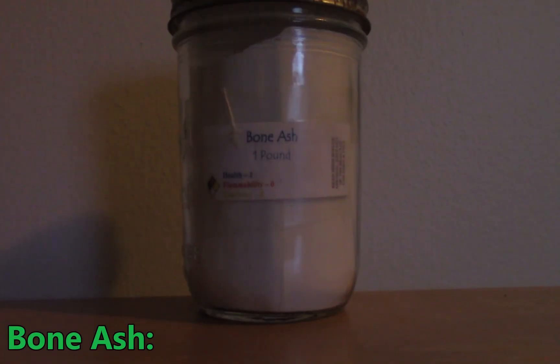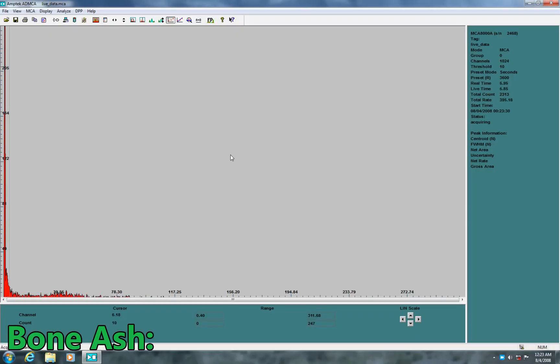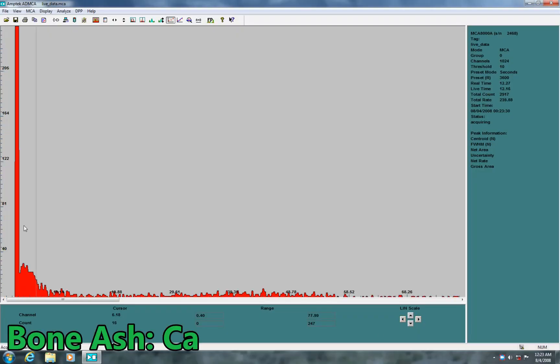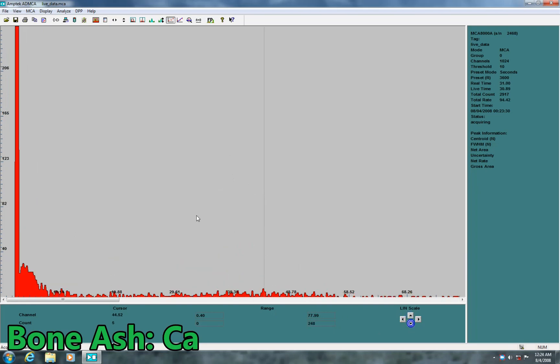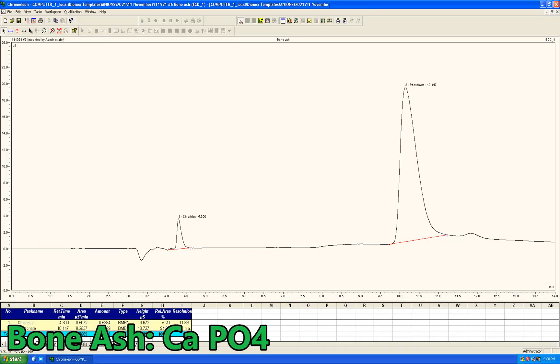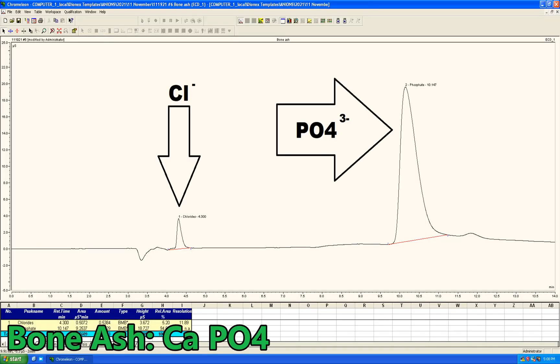Starting with the bone ash, the XRF immediately picked up the large calcium peak on the left, and maybe some heavier metals — it's hard to say with my poor resolution — but calcium is definitely present. Along with the expected phosphate, the ion chromatograph also picked up a small amount of chloride.